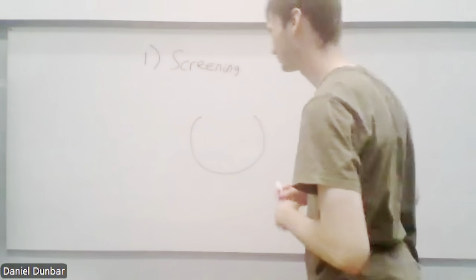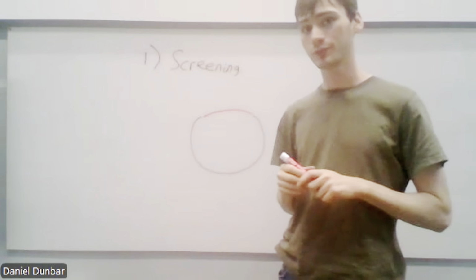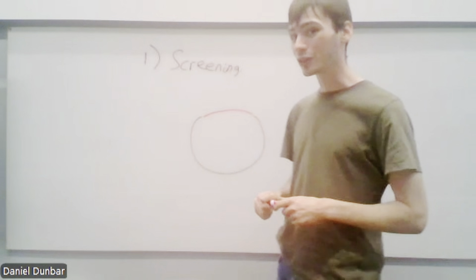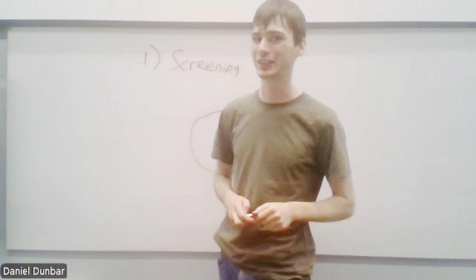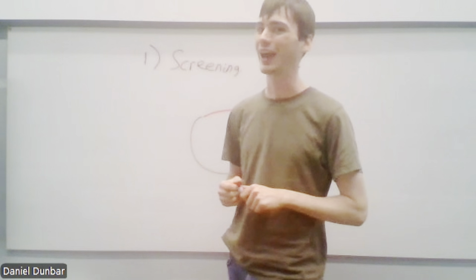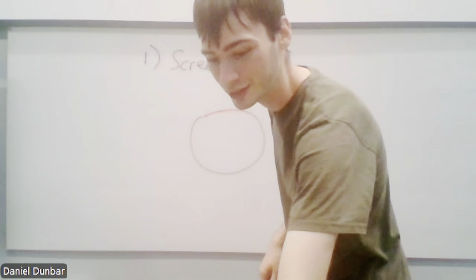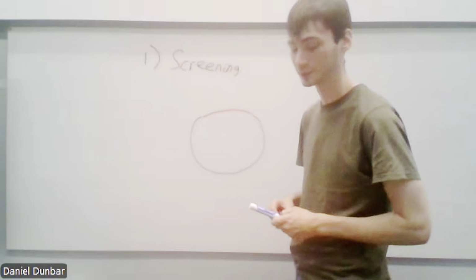So our insert is in red. But how do you know that the correctly transformed bacteria actually have the insert in? How do you know it's not an unassembled plasmid? Well, the first answer is do it with Gibson or Golden Gate because they have very high yields. But that's not a particularly robust answer, and that's not an answer that the scientific community will accept. So we use screening PCR as our first line of checking. The gold standard is sequencing, but sequencing costs more.